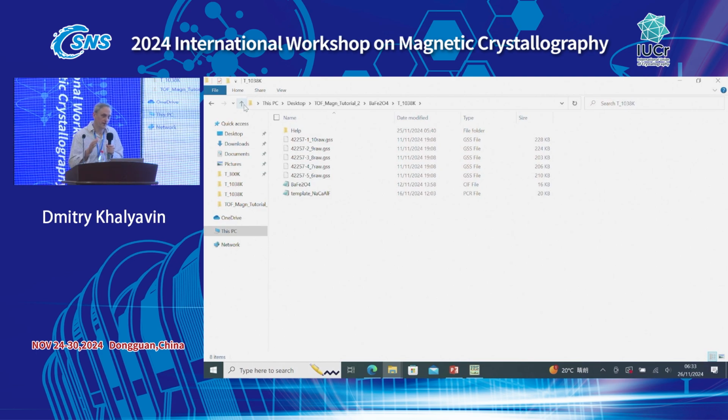So you need to present a Rietveld refinement of X-ray data collected on the sample you want to measure with neutrons, because neutrons are a very expensive way to check the sample quality. So it has to be done with X-ray.